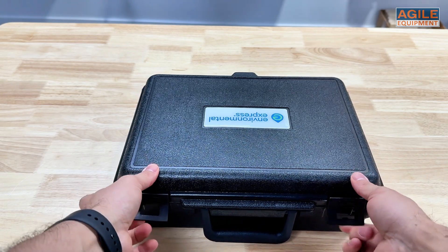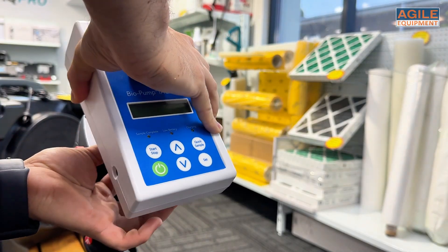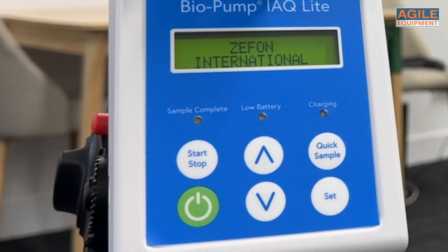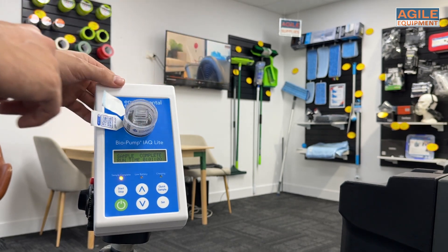One of the best things about the Biopump IAQ Lite is just how easy it is to use. For optimal results, mount the pump on a tripod, switch it on, attach the sample cassette, and press the quick test button. In just five minutes, you'll have an air sample.